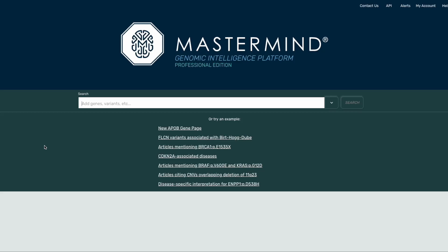In this video tutorial, I'll be showing you our gene page live in Mastermind. Any search for a single gene with or without a disease, phenotype, or therapy will land you on the gene page. Let's start with a search for the gene ENPP1.